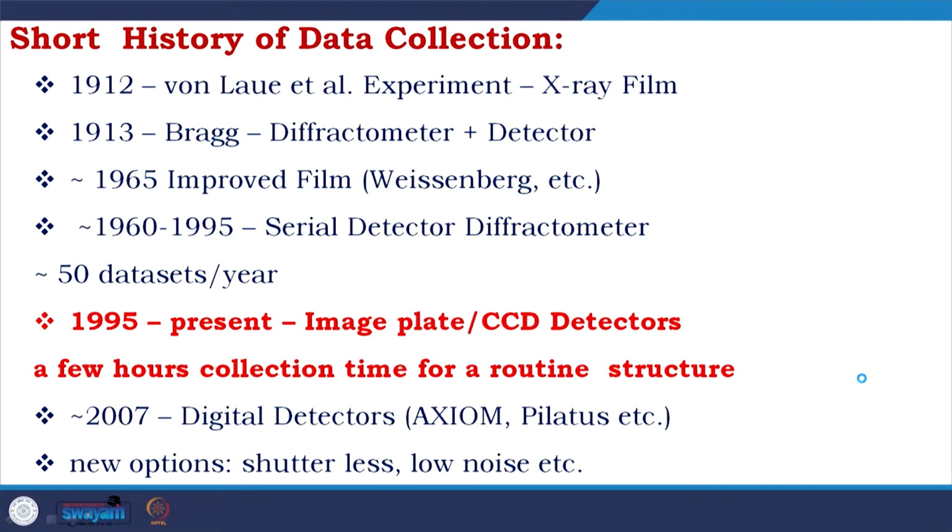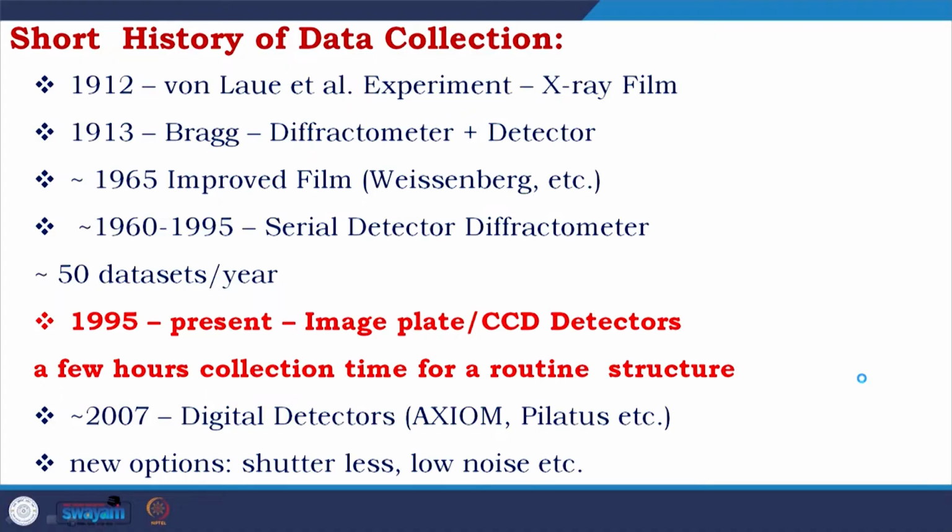When we think about data collection, we always talk about the opening and closing of the shutter, but now shutterless options are coming, the noise is reduced, the intensity is enhanced. So crystals from which we never thought enough data could be collected to solve a structure are now being solved. Especially twinning: when I started protein crystallography, we used to get twin crystals and generally throw them away and try to get new crystals.